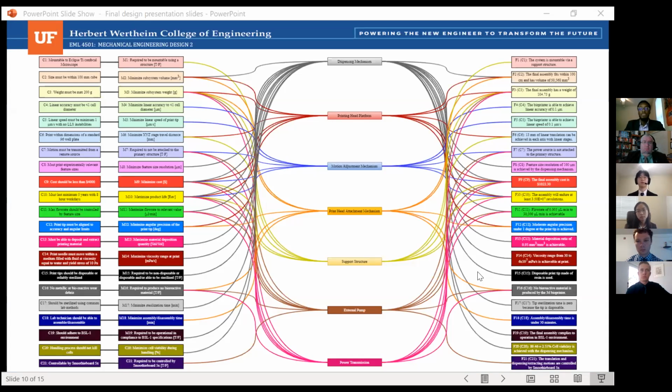Key performance features of our design include flow rate as low as 5 nanoliters per minute, linear speed as low as 0.1 micrometers per second, and achievable feature size resolution of 100 micrometers. This flow rate, along with the linear speed, may be dynamically controlled to print a wide variety of features and feature sizes within the limitations of the 96 well plate printing medium.